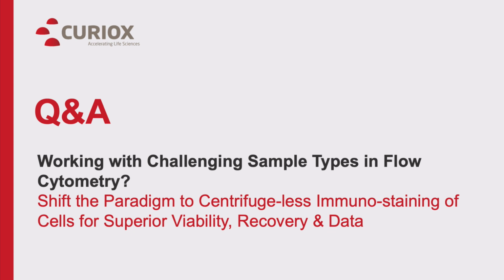Right. Okay. For the person, we've traditionally done centrifugation for those types of cells, but I can tell you right now, we do have some collaborations going on when we are addressing using the Laminar Wash system with these cells. Again, we're in a situation where iPS cells can be fragile, and there's not many of them around. So you could do plates, you could do tubes. I've worked with iPS cells in my past life. Depending on where they are generated from, they can be difficult. I don't have any data to show you right now, but I can tell you internally we are working on using this system and adapting it to that particular cell type.